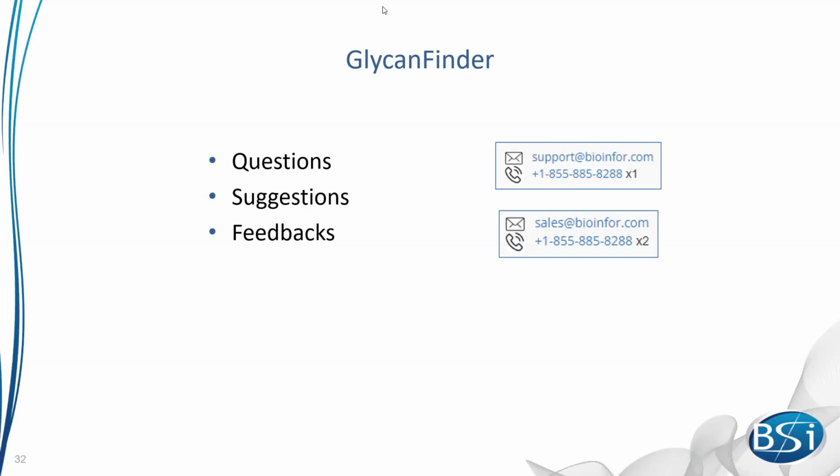You will get more confident identification for glycans there. But the general proteomics data can also be used, and we can find some results from there. Internally, our workflows will be a little bit different, but from the user's perspective, you will see no difference. Thank you.